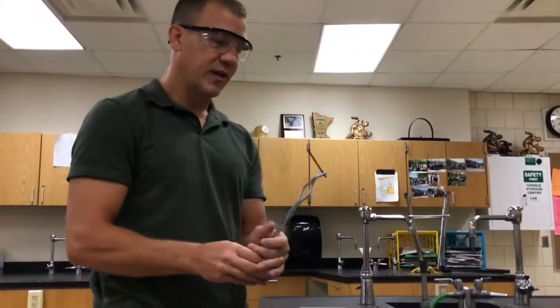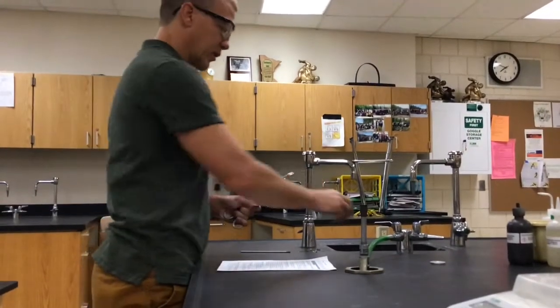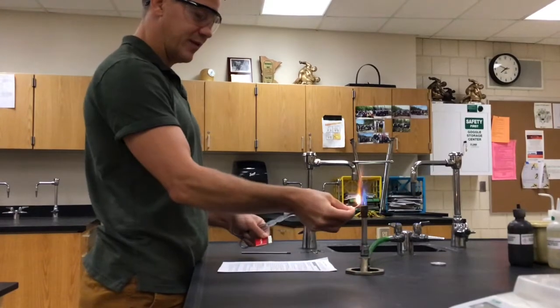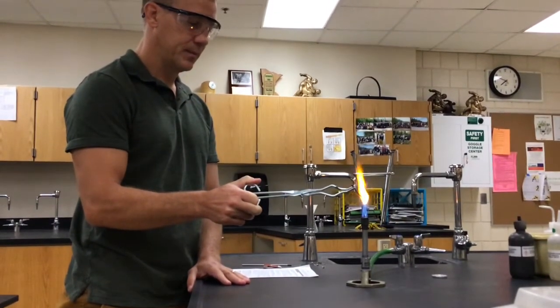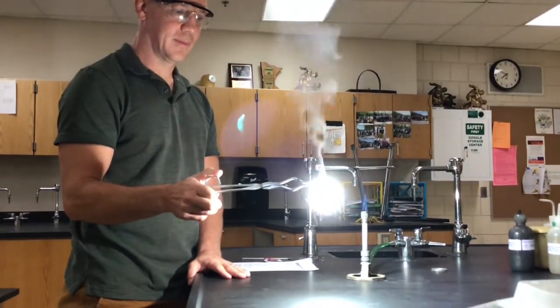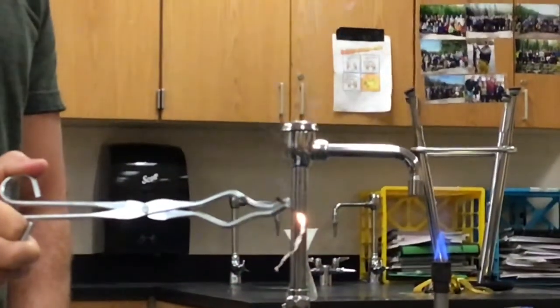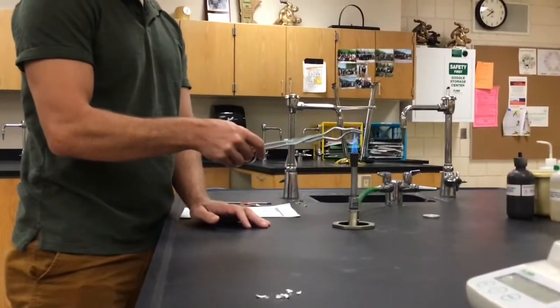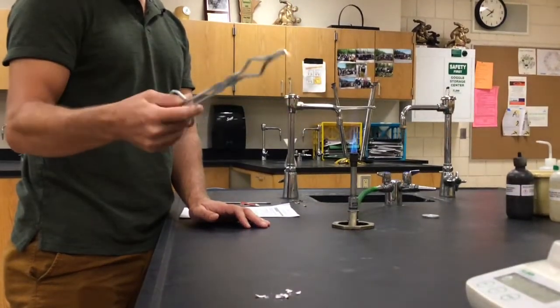Now we're going to take a piece of magnesium ribbon and place it in the Bunsen burner. We're using tongs here so I remain safe. I'm going to ignite it, then pull it a little bit out of the flame so you can see it. Come take a look at what is left and look at some of the properties — we've got a little bit of magnesium left. So that was magnesium in a Bunsen burner.